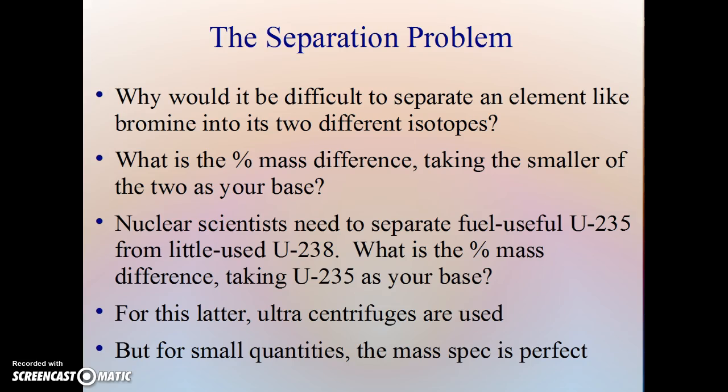If you say, well, let's chemically separate them, the problem is, for carbon or for uranium, for anything that is just a matter of separating isotopes, the chemistry of the isotopes is exactly the same. The reactions they undergo are not different.